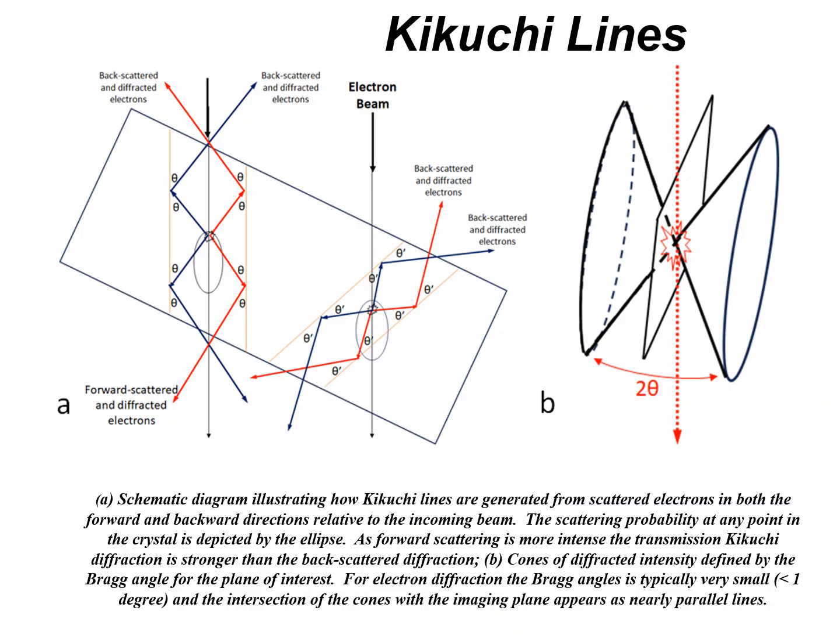Kikuchi lines, I don't want to get into Kikuchi lines. If you've done TEM, you'll understand what I'm talking about. When an electron comes in, it can interact directly and strongly with a diffracting plane where you have a high atomic density. If you've got the angle coming in at the Bragg angles, you will get strong diffraction coming out. But you don't have to have that orientation when it comes to Kikuchi lines, because any electron going through the foil is being scattered at all different angles.